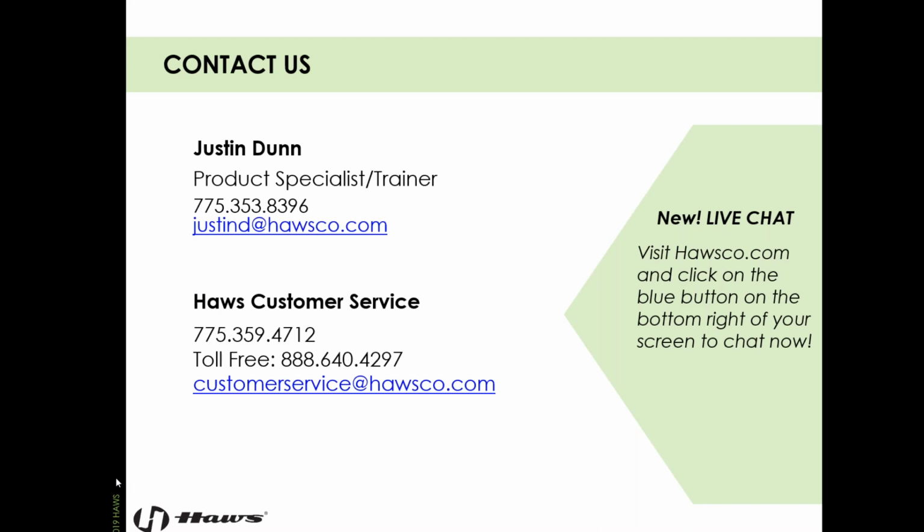And then final one, what guidance can you give for locations that cannot have plumbed eye washers? For locations that can't have plumbed eye washes, portable, self-contained equipment is ideal in these situations.